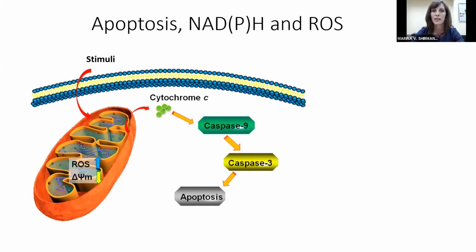But the dynamics of the changes in different biochemical pathways are not fully understood. For example, it is not known how activation of caspase-3, a key effector caspase in apoptosis, cellular energetics, and reactive oxygen species (ROS) production correlate with each other, and what the dynamics of the changes in each of these parameters are during apoptosis. This is what we try to look at.